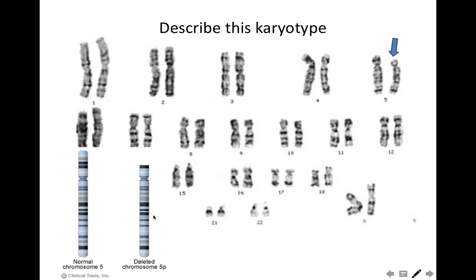I compare it to the ideogram of the chromosome that has got the structural abnormality to determine where the break happened. يبقى البريك اهو موجود هنا، ادي الدارك باند اللي موجودة بعد السنترومير.